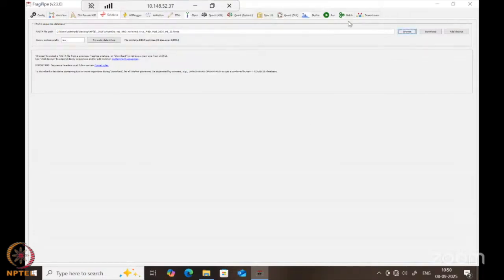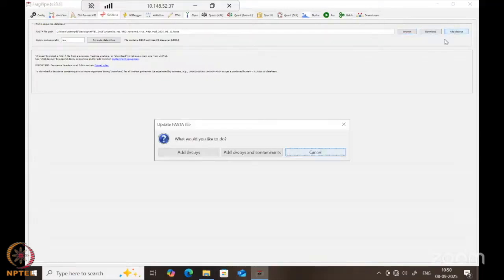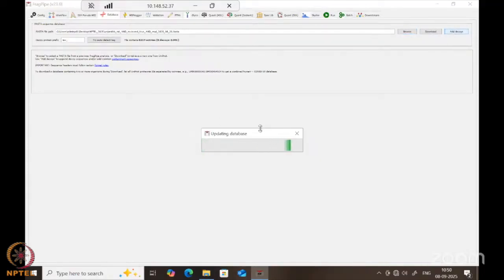I can see this is uploaded, and you will add decoys. A decoy is basically the reverse of the entire FASTA file of the rat proteome. It is a non-existent database that will try to match with your original database, so you can estimate false positives and control the FDR, removing false positive protein sequences. It's taking some time to upload the database.